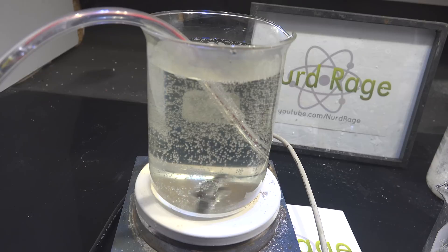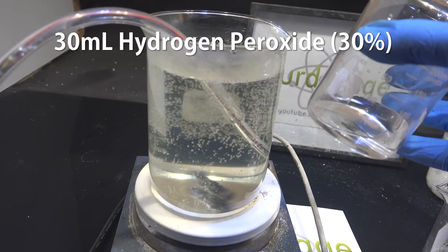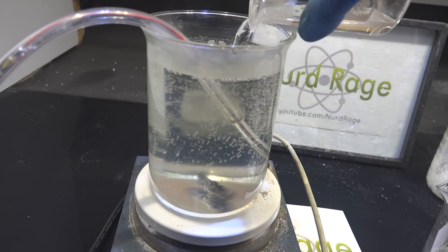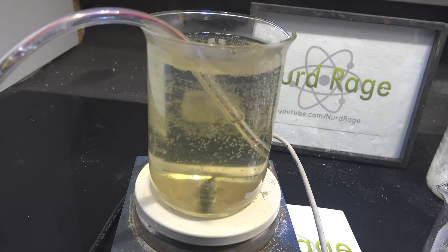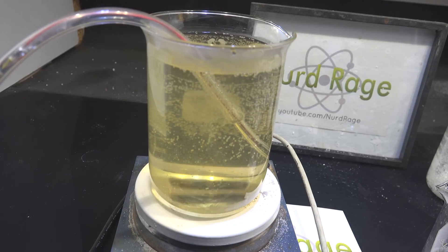We're at the right temperature. Now we add in 30mL of 30% hydrogen peroxide. You can also use 300mL of 3% hydrogen peroxide, but you'll have to use less water in the original mixture. Now we turn off the lights and wait.